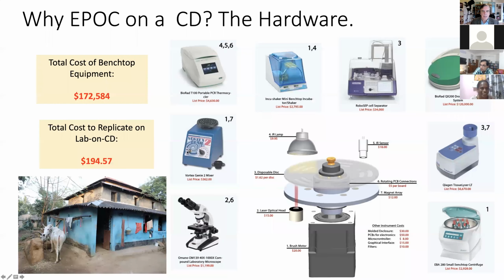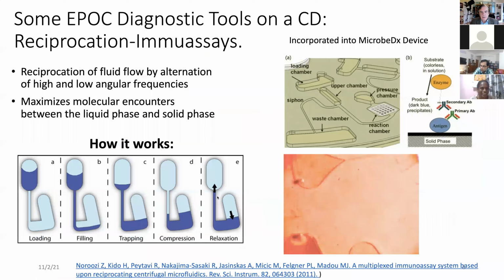Here. What we're talking about is, normally liquid goes like this, right? Pushing it out. But I want to bring it back up. And you can see I've done that here. See? I brought it back up. So did you understand why it goes back up?